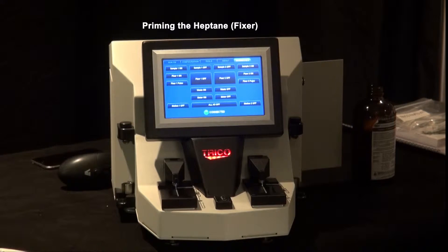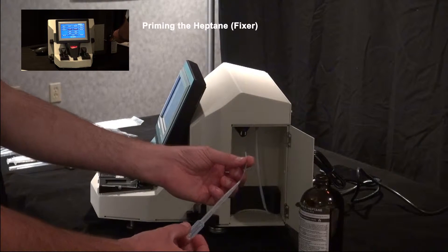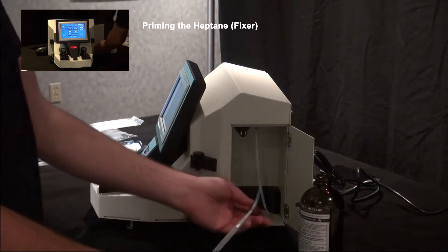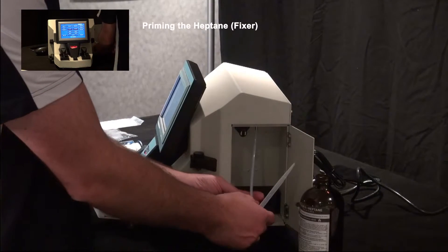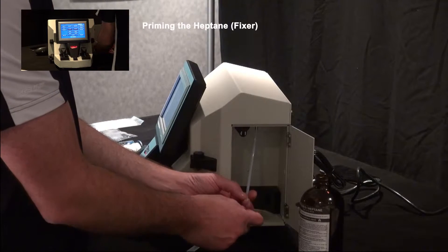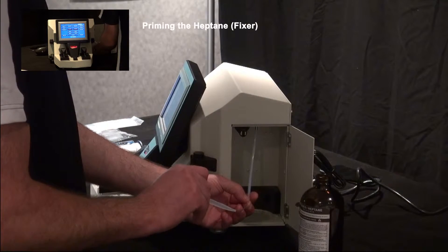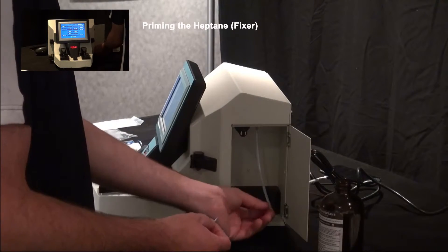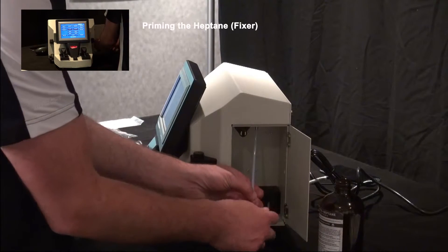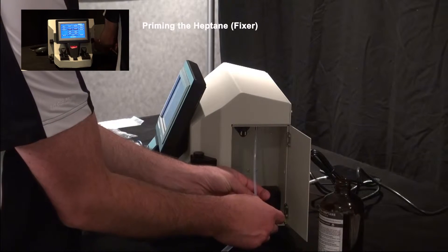With your priming bulb — which is a simple plastic pipette with tubing on the tip — you've got to fill it with heptane. Then separate the small tubes and plug each one of them into the end to prime the unit. We have heptane in our fixture priming bulb. Pull that first little tube apart and plug it into the tip.